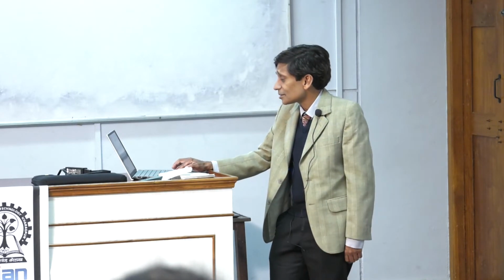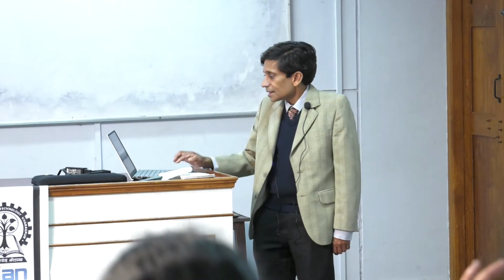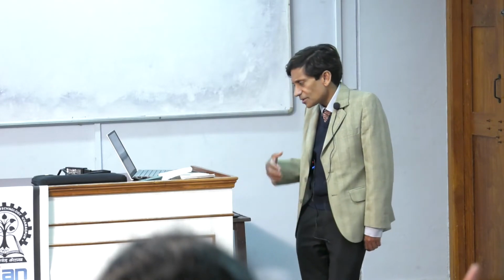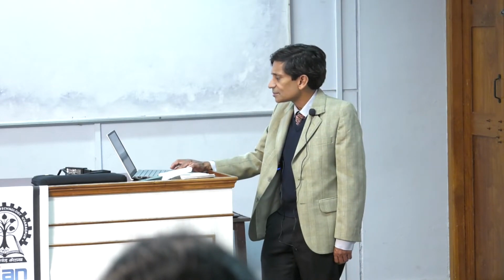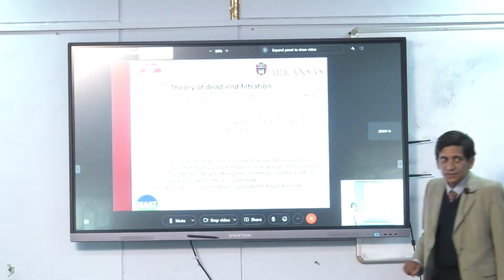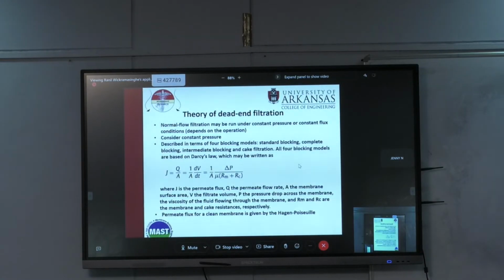This is called Darcy's law, where the driving force is the pressure drop between what I apply, and the bottom term is just a resistance term. Okay, if you are aware of this area, there are 2 resistances we talk about. We talk about the membrane resistance and the cake resistance. Okay, so the cake resistance is what's starting to adsorb there, and this is changing with time.